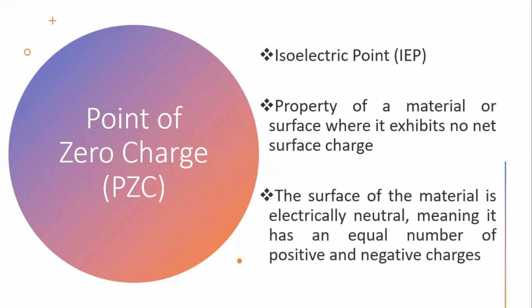Saqib Khan Science Academy. Today we will learn about point of zero charge, how to measure the point of zero charge experimentally, and then how to plot the point of zero charge and measure it from the experimental data. Point of zero charge is also known as isoelectric point.